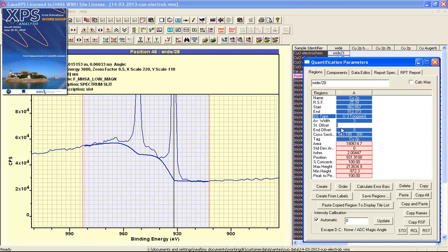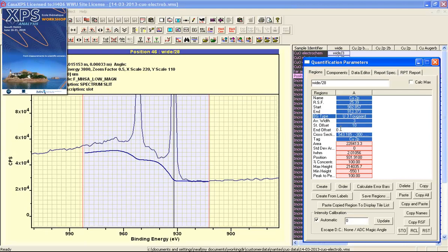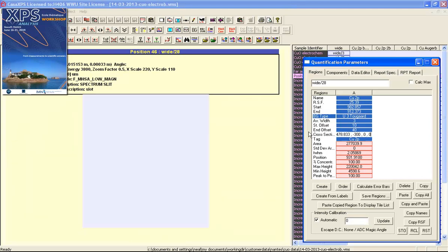We also have a start and an end offset. These two values are specified as a percentage of the intensity of the background at the two limits. If I made this 10 for the start offset, then the background is reduced in intensity relative to the data by 10% of the signal.